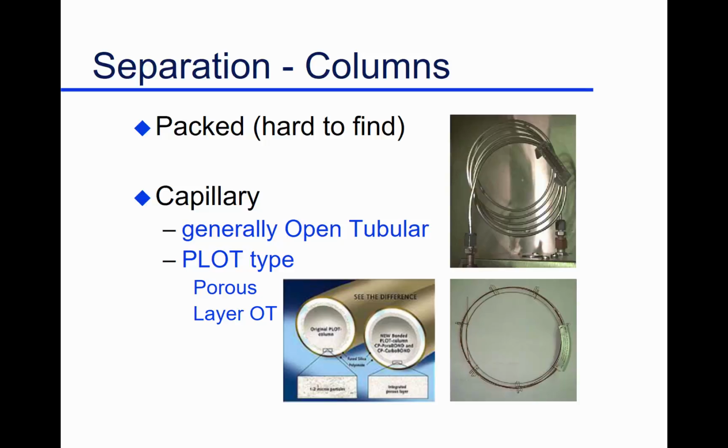So that's the injection. Where does everything go? It goes into our column. And I think we have to go to one of the museums these days, although you will find a glass one sitting out by the flavor lab that's still sitting there. It's on its way to disposal. This happens to be a stainless steel column. Back in the olden days, that's what you'd have. You'd have a stainless steel column, typically 1/4 inch in diameter, which is massive by our standards. And it may be 6 feet or 8 feet long.